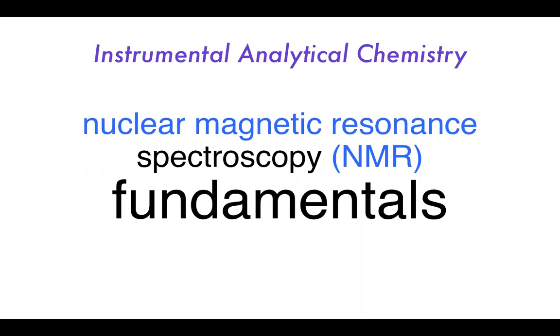It's really useful. I can't emphasize that enough. If you want to know what a particular molecule is, and so long as it contains a few select elements, so usually as long as it's biological or organic matter or some sort of pharmaceutical or a polymer or really pretty much anything, you're going to be able to determine what it is using NMR spectroscopy.